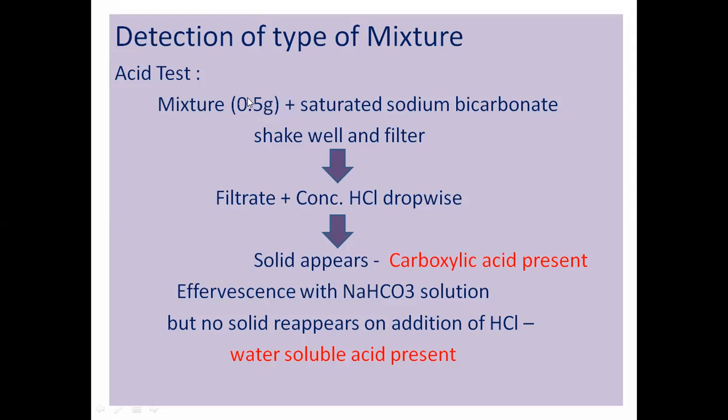First, what we have done, we dissolve that acid in saturated sodium bicarbonate. We don't know what that mixture contains. So we take this mixture, we add the saturated sodium bicarbonate. Why is the saturated sodium bicarbonate added? Because if the acid is present, it will react with the sodium bicarbonate. It forms the sodium salt of acetate, which gets dissolved. It is a salt, COONa, so it will go in the water. You can't see it, it is in dissolved form.